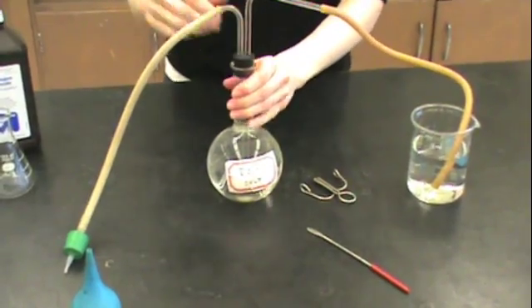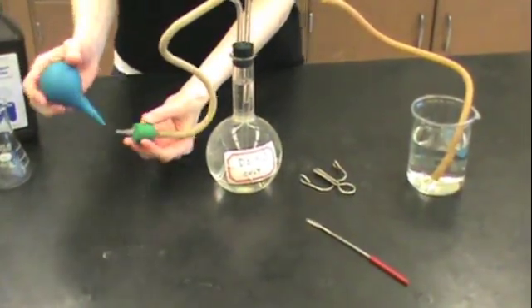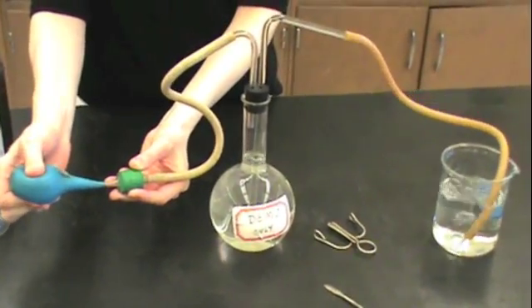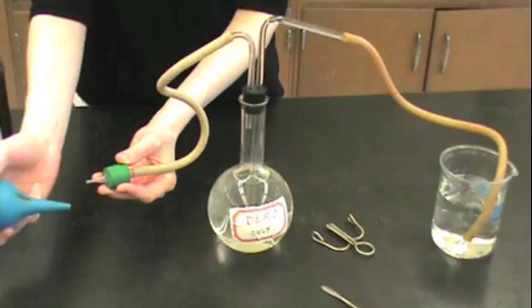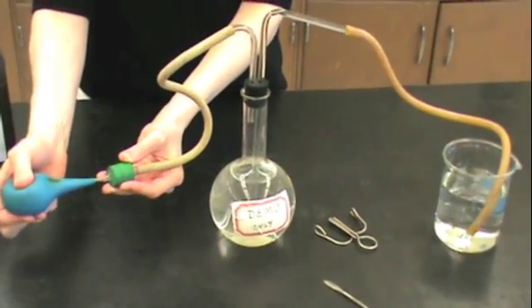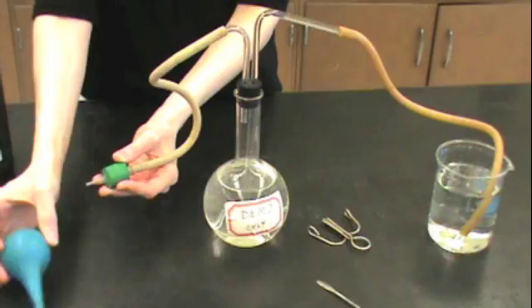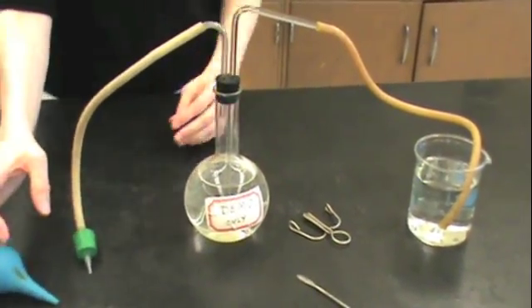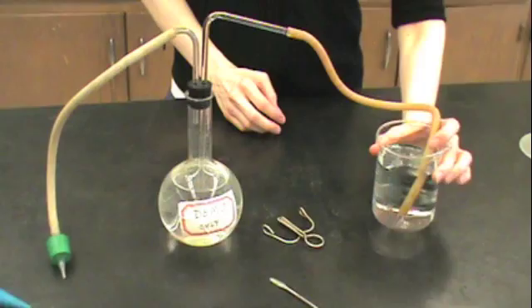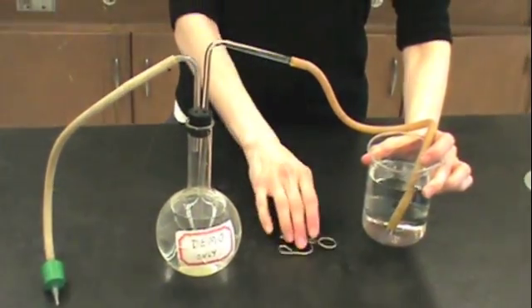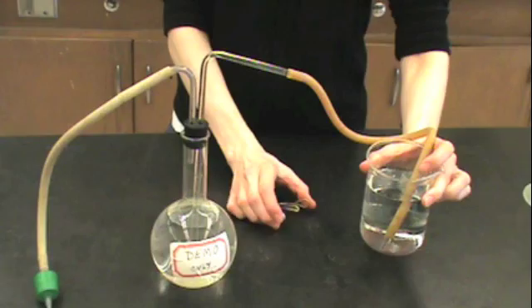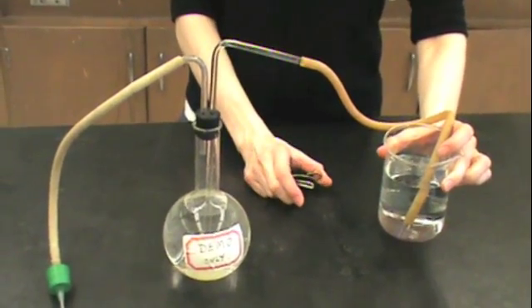Make sure that the stopper is secure on your Florence flask and attach the bulb to the tubing. Squeeze to push water from the Florence flask into the beaker and fill the tubing. Make sure you don't suck with the blue bulb, only squeeze gently to push air through. Now raise your beaker so that it puts the water level at the right level in the Florence flask as it was before.